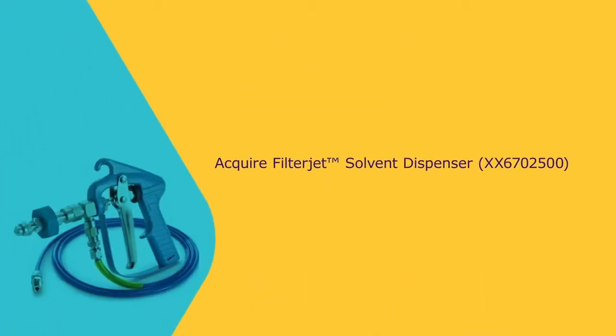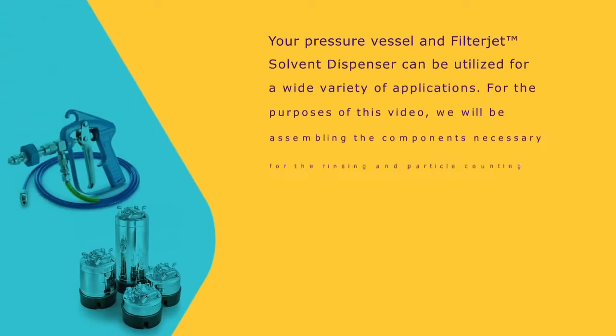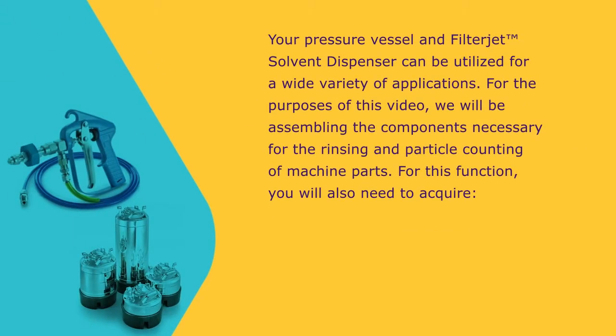You will also need the filter jet solvent dispenser. Your pressure vessel and filter jet solvent dispenser can be utilized for a variety of applications. For the purposes of this video, we will be assembling the components necessary for the rinsing and particle counting of machine parts.